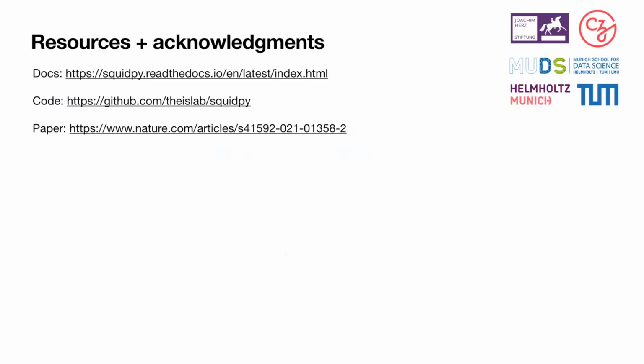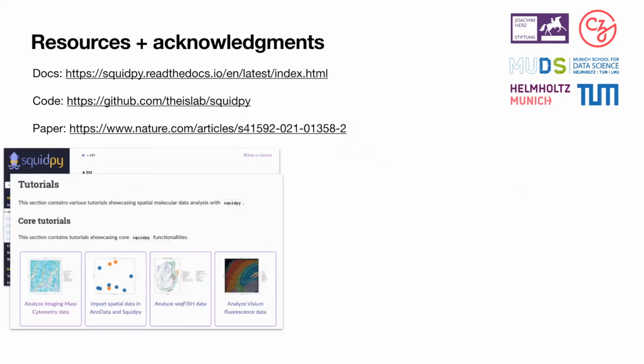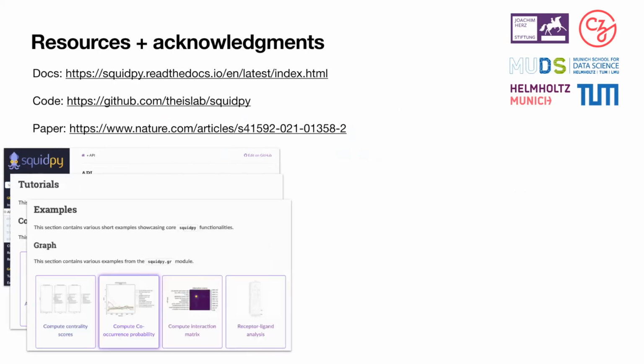Right, we have quite extensive documentation on Read the Docs with a lot of tutorials. Actually, there is quite a nice API. There are, like I said, tutorials and a lot of examples and so on. So if you have more doubts about what any of the functions we'll be covering in the labs are doing, you can also go and check all of these tutorials and API examples out. And hopefully this already answers a lot of your questions.